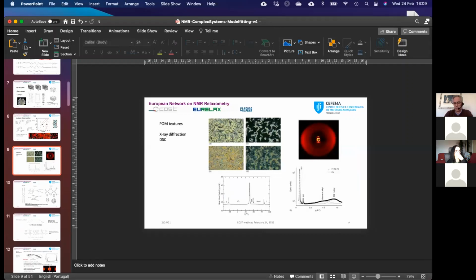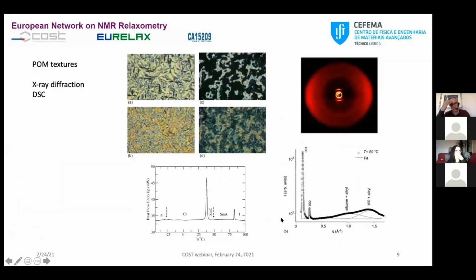The X-ray data is quite important when analyzing a new sample, a new system, because it can put into evidence the average lateral distance between molecules. Now the X-rays are obtained over a large amount of time, so they really represent the average distance between the molecules over a large period of time. Of course, the molecules move, but they will have to show on average these particular distances.